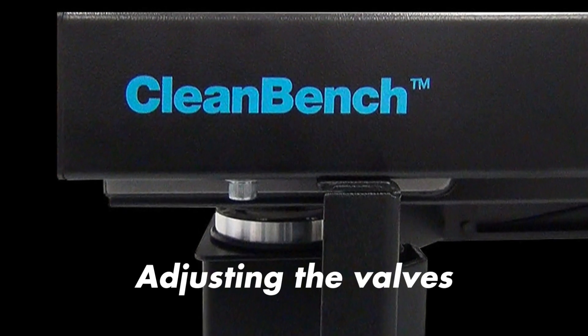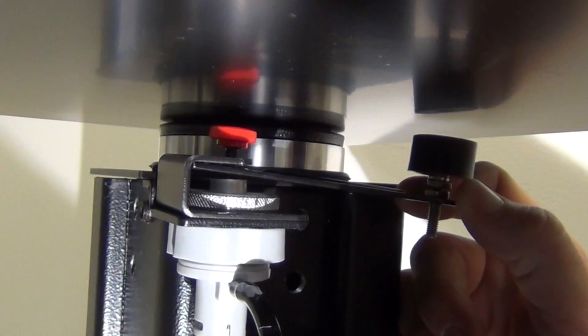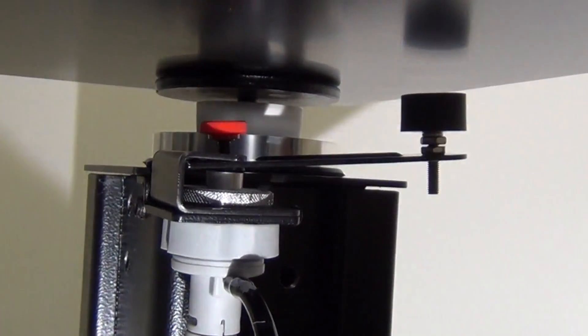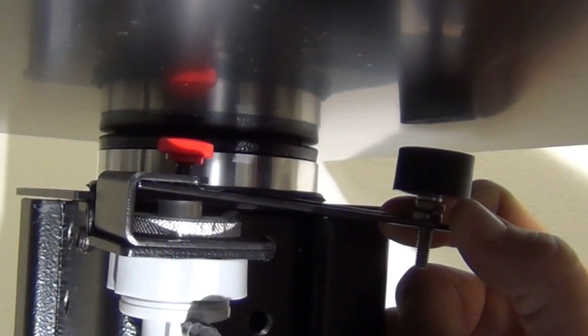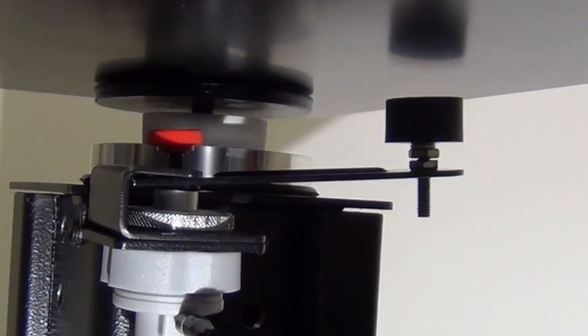We are going to start with adjusting the air in the back left leg. This leg also controls the back right leg. Push the valve lever arm down and become familiar with how the isolator responds. Run the isolator all the way up to its max travel. Notice the rate at which the isolator moves. Listen for the airflow.